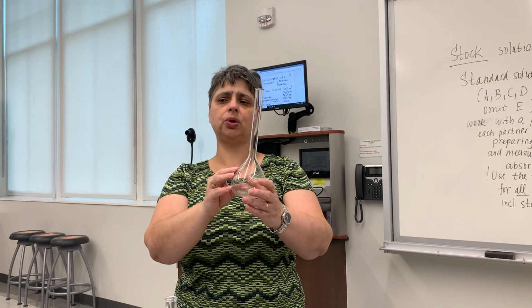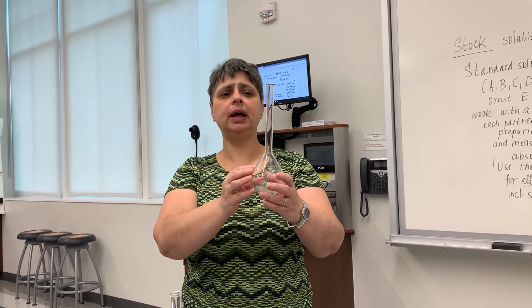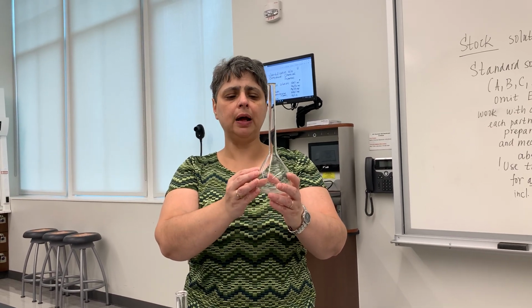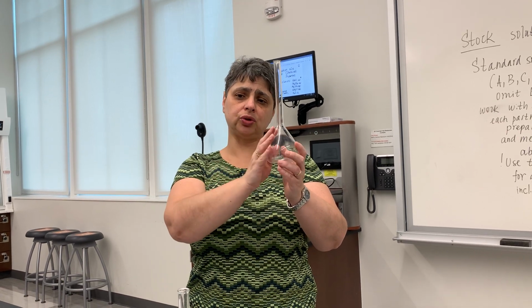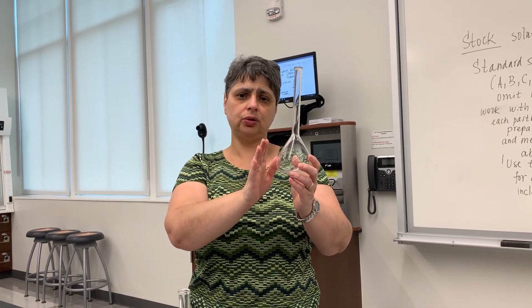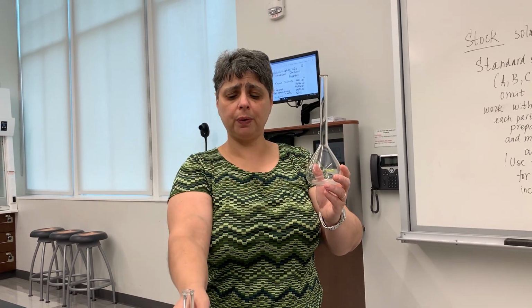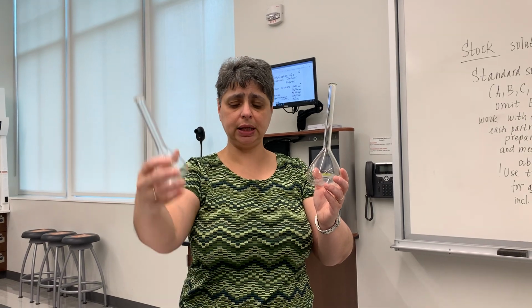It may be either yellowish or blue, depending on which medicine you are assigned. That is not a problem. It's not going to screw up your results. If the solution happens to be colored, don't worry about it. It will still turn the same purple as before once you add the yellow solution in here.